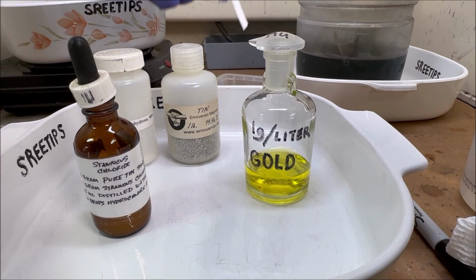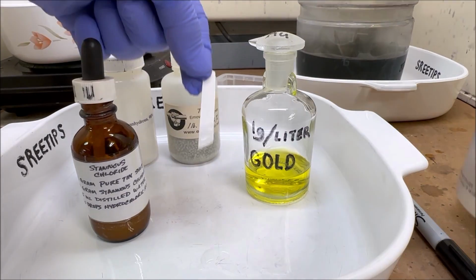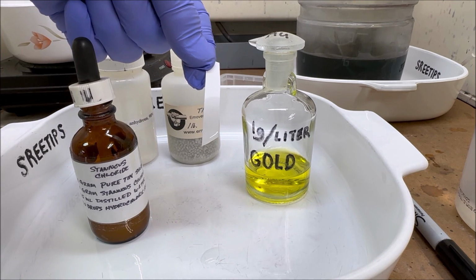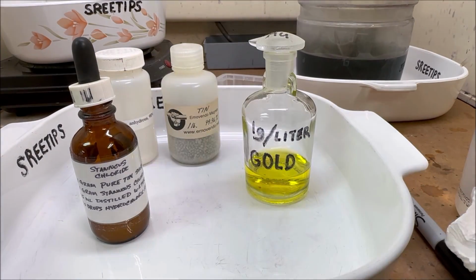All right, we'll do another test here. This is with some distilled water. And you can see the test on distilled water is nothing. It doesn't react.